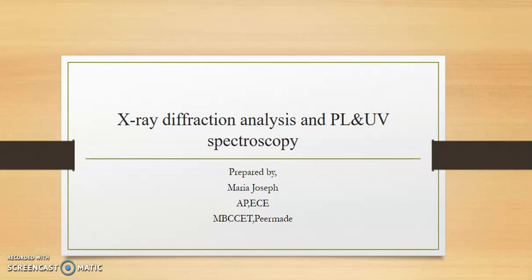In this class, we are going to learn about three different topics. One is X-ray diffraction analysis, one is PL spectroscopy, and the other one is UV spectroscopy.